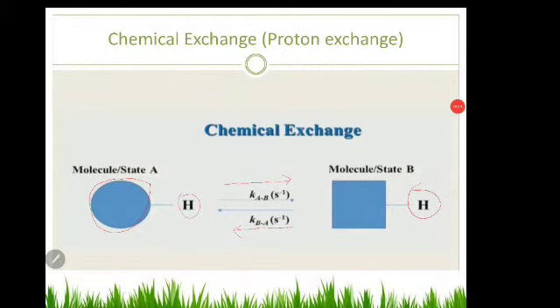And here the exchange is expressed in hertz, or it could be told in per second. And what is this chemical exchange all about? What do we discuss when we discuss chemical exchange? It is the rate of exchange. We are focusing on the rate of exchange, whether the rate is slow, intermediate, or fast. That's what we are going to discuss.